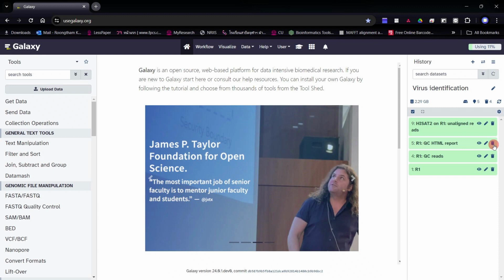I want to point out here that there might still be some pig genome sequences in our dataset. HiSat2 might not eliminate all the host sequences, but the majority of them have been filtered out. Normally, after this process, up to about 60% of the dataset might be removed. So now, we can work with a much smaller and cleaner dataset. Suppose we have removed both of the pig reference genomes from our dataset. Now we will call this dataset clean reads.